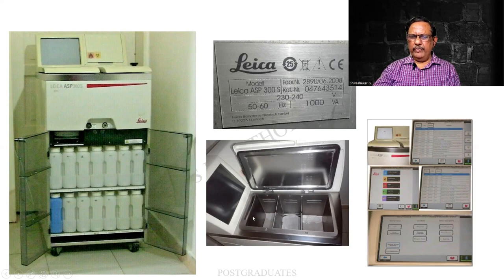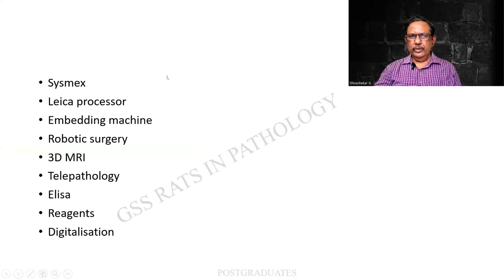There will be three parts of it. And depending on the amount, it can be either one change, two, or some institutes insist on three changes of wax. And once it is quite old, the first one will be discarded, the other two being used. And these are the various monitors, where the changes of the timing, etc., can be done. Thanks to Leica. Maybe there are other companies over here, but this is my personal experience and I feel it has stood the test of time.